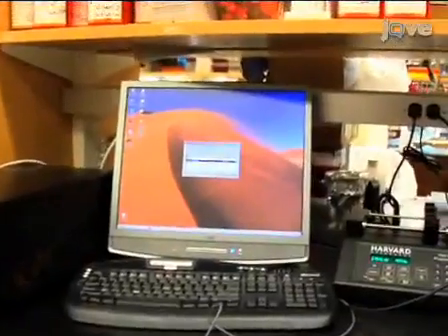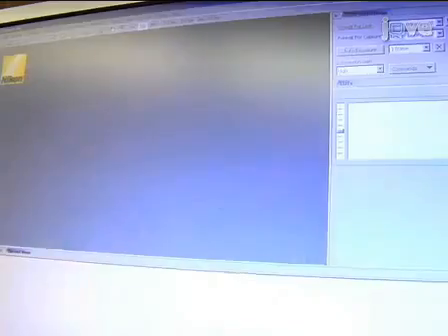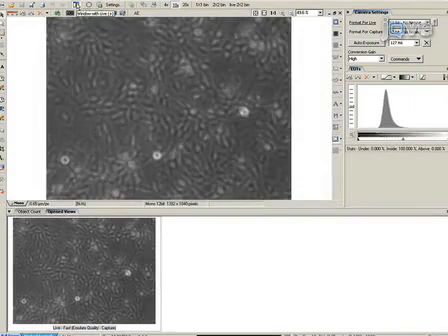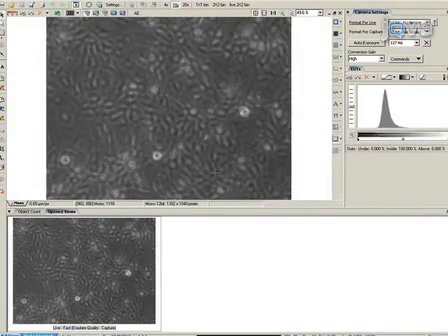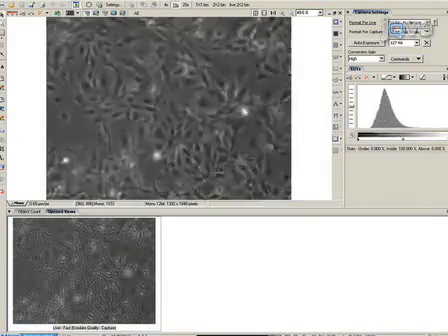To capture leukocyte rolling events, open NIS Elements on the desktop. Press the play icon for a live image. Auto exposure will allow you to see the plate and to focus the image. Be sure the microscope is focused properly on the cell monolayer by adjusting focus manually on the microscope.